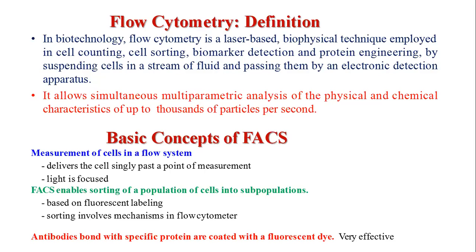So it allows simultaneous multi-parametric analysis of the physical and chemical characteristics of up to thousands of particles per second.